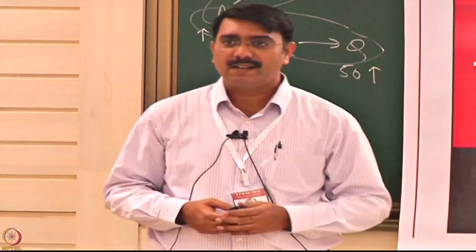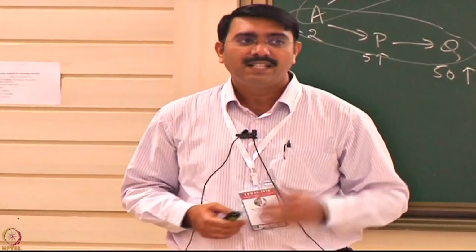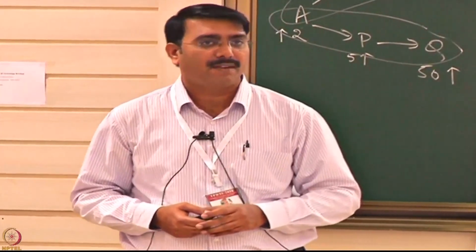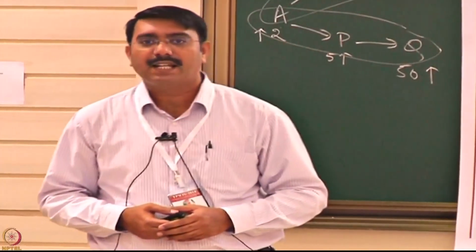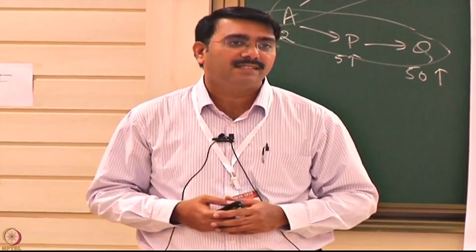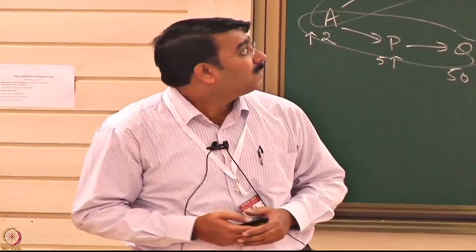This is the alternate technology, Bio-Layer Interferometry, the interference based technology. SPR is the surface plasmon resonance, but technology wise this is very different, as well as a high throughput platform. So how this technology will be helpful in interactomics kind of workflows, I will go through what the technology behind it is, the principle behind this, and how you can use this technology in your applications. So I will go through that.